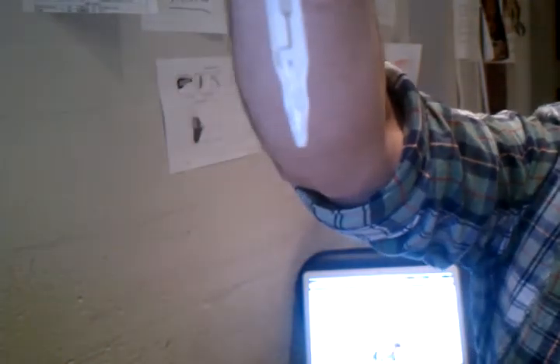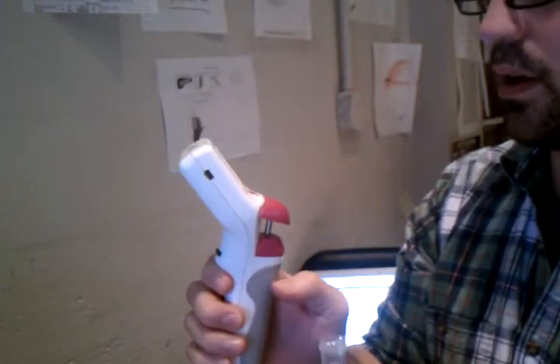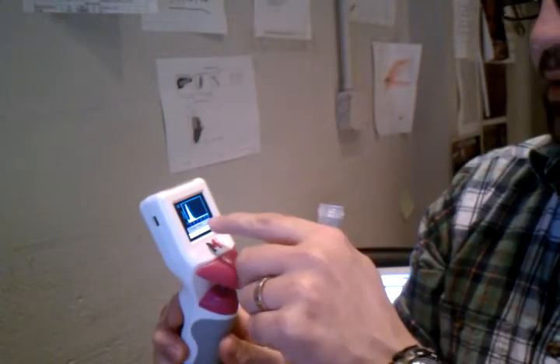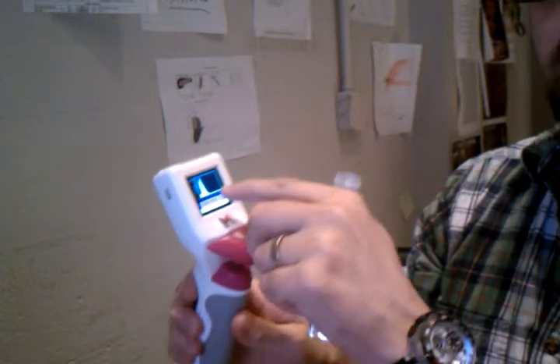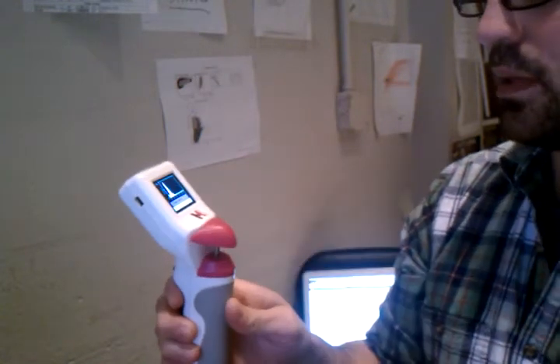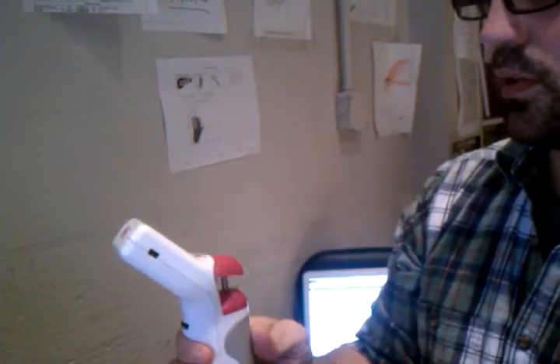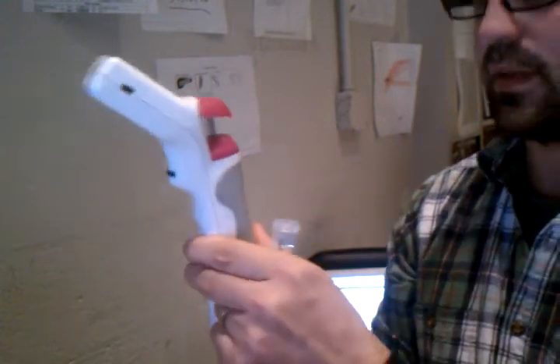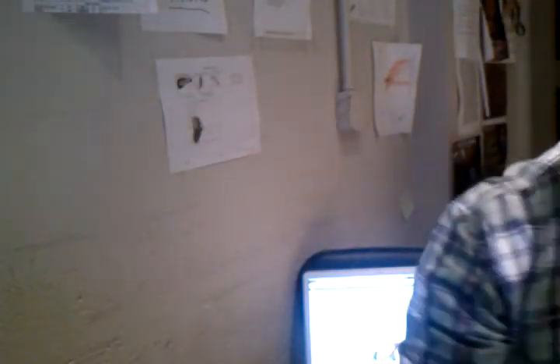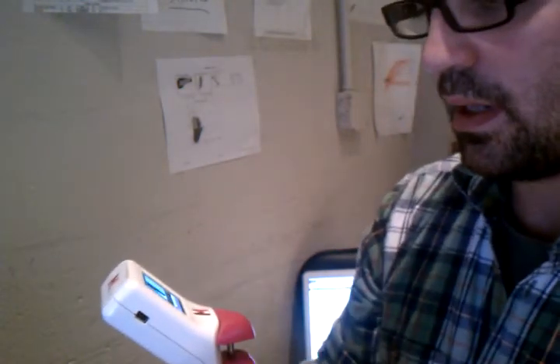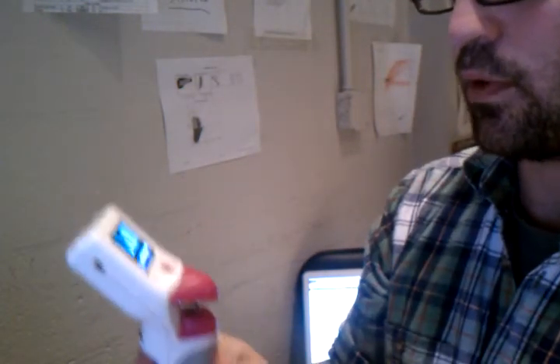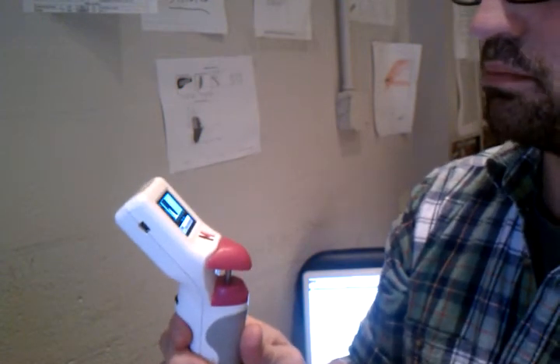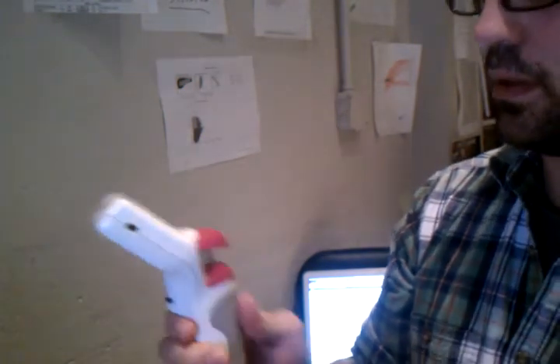And what you can see here is that there are some bubbles. And it actually messes up the count to give us these low volume events in the bottle. So the count here with the bubbles. Of course I could gate them out, but with the bubbles we're at about 700,000 per mil.